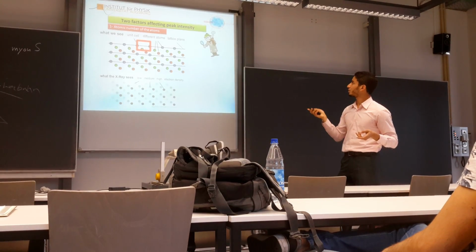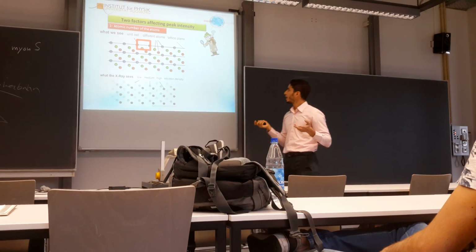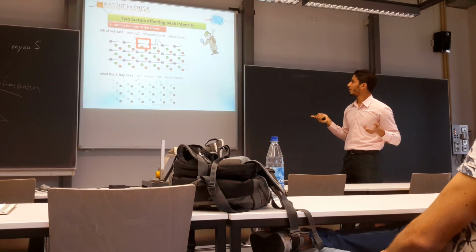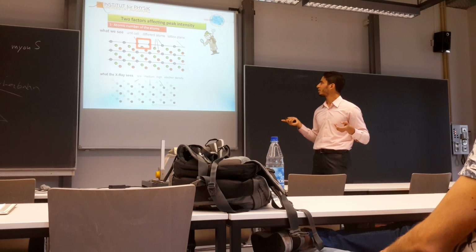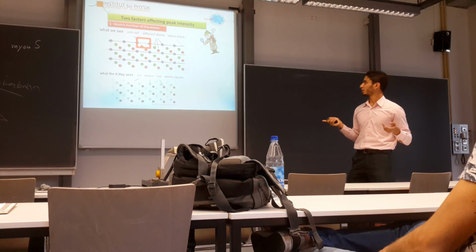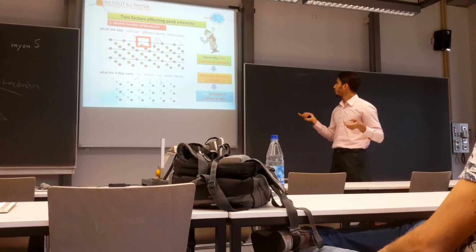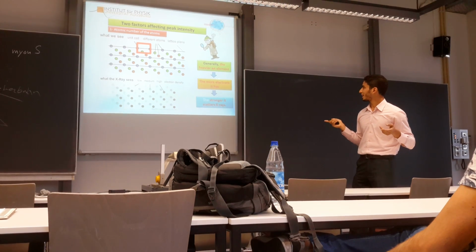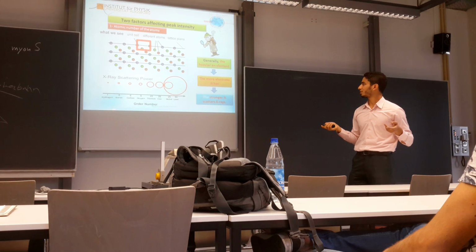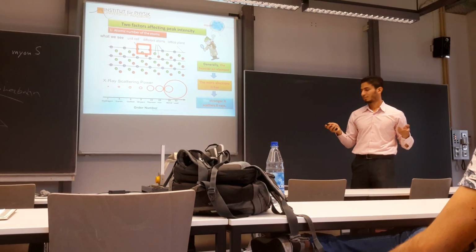The first factor is the atomic number of atoms. When you look at the lattice or the crystals, you are concerned with things like the unit cell and the presence of different atoms here. But X-ray is different. X-ray is concerned with the electron density. Some with low electron density, some medium, some with high electron density. So we get the final rule: the heavier an element, the more electrons it has, the stronger it scatters X-ray. And you can imagine here, starting from hydrogen passing by boron to nickel and lead, X-ray scattering power increases.